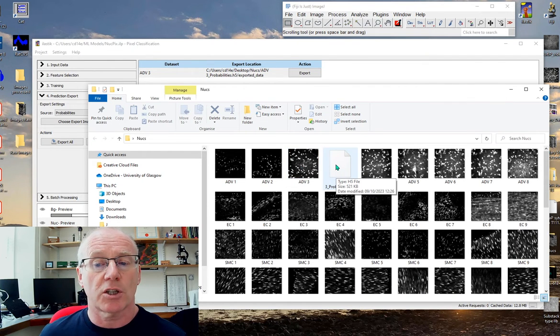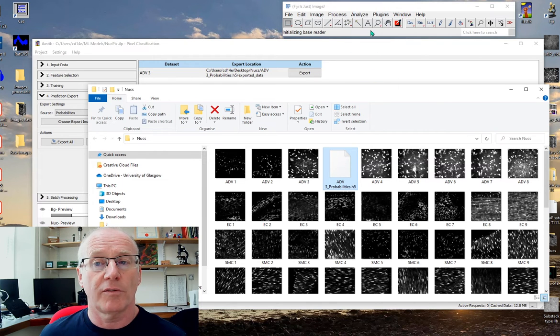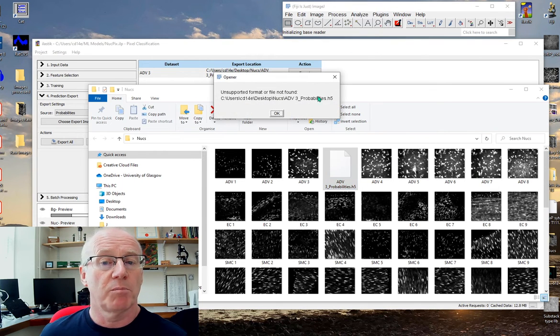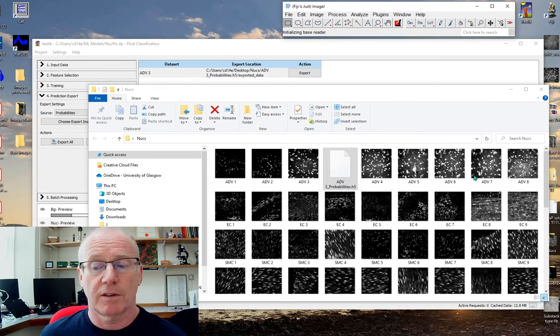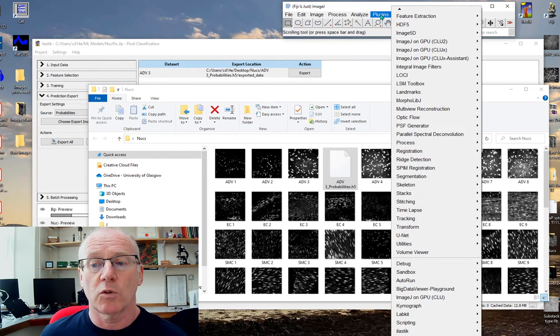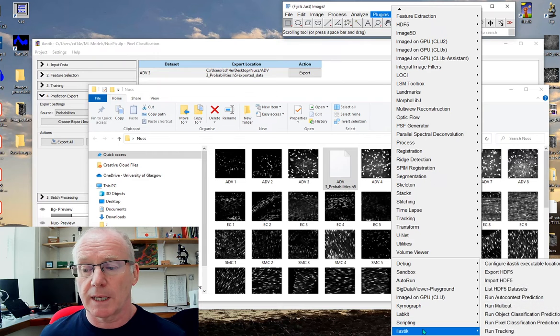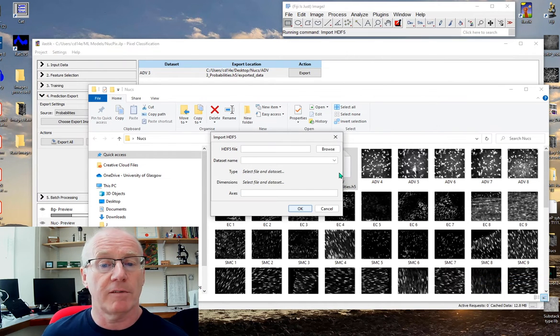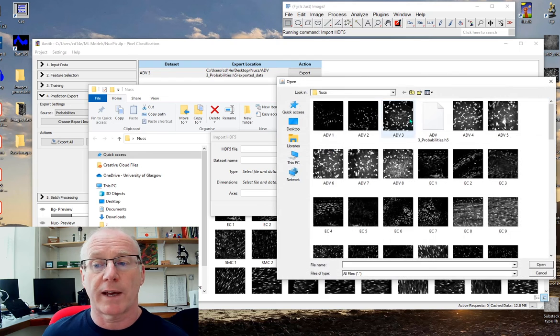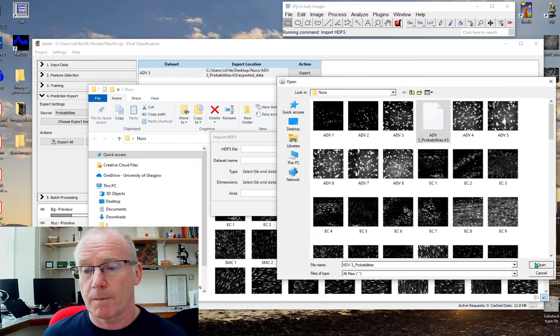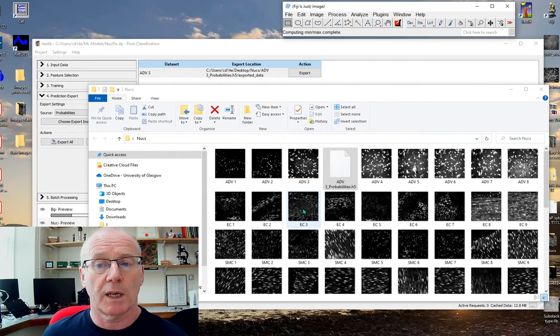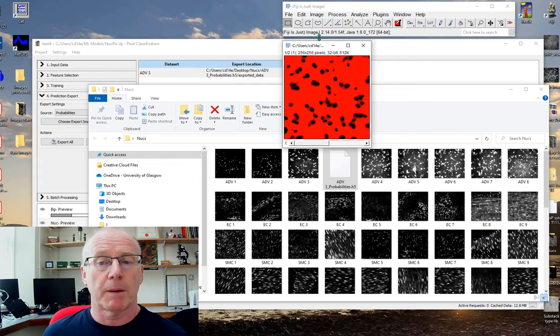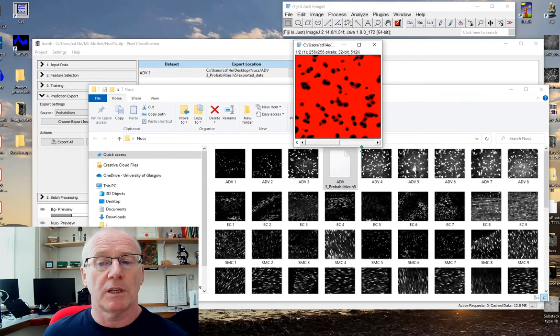I can't just simply drop this into Fiji because it doesn't recognize that HDF5 type of file, but I can go to my plugins, go to Ilastik, import HDF5, browse for that image, there it is there, open it up, click OK, and that's us into Fiji.